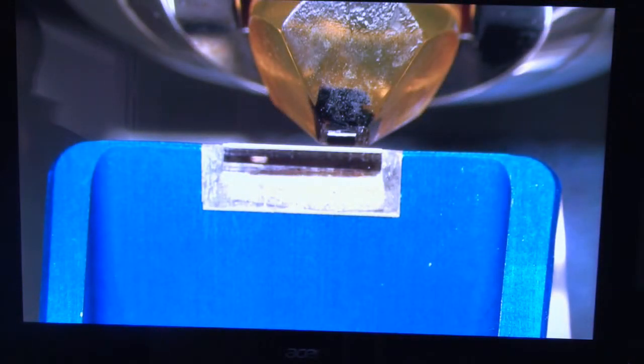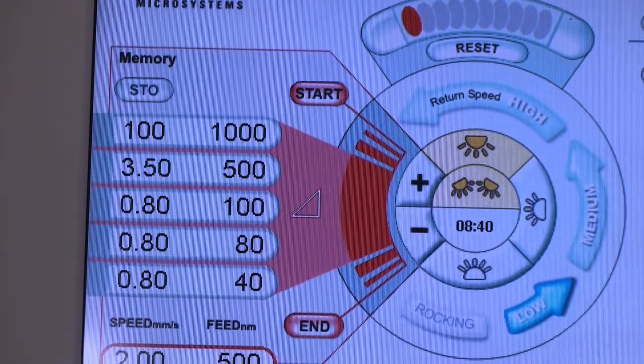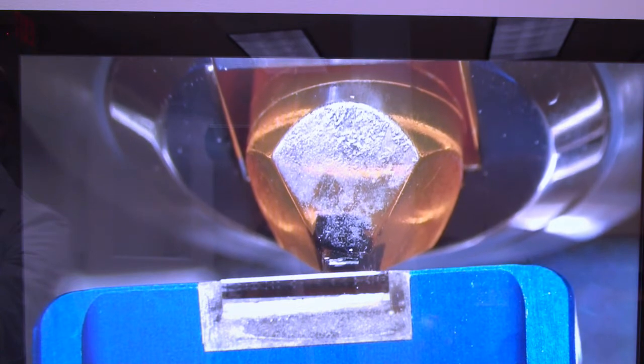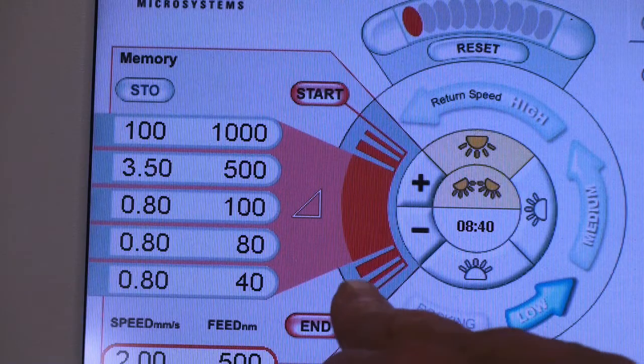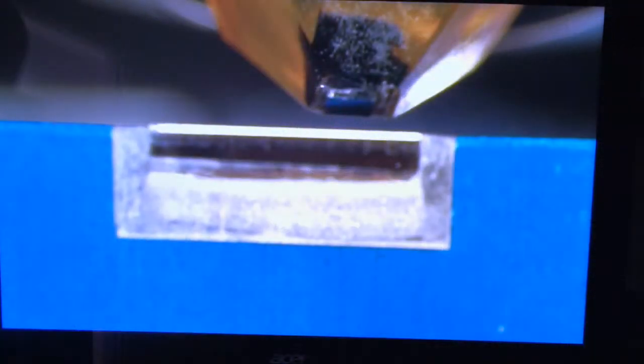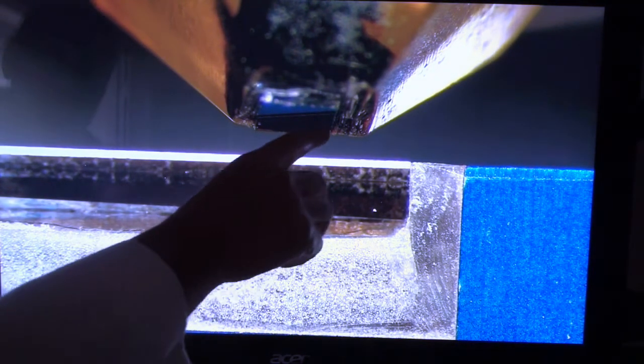You might have a knife mark in one area. The next thing we want to do is set our sectioning window. And first we do above where we would want our sectioning speed to start. And then we move the block down to where we would want it finished. And that's the region that it goes through the cutting speed. Next we want to make sure that we have a good view of what we're looking at. We want to put the field of view, our objects, our block face and our knife right in the middle of our field of view and in focus. That's important for our next step which is the alignment of our block face.